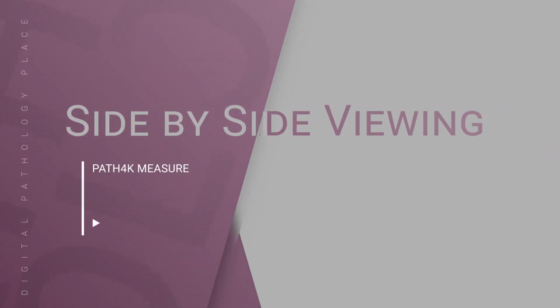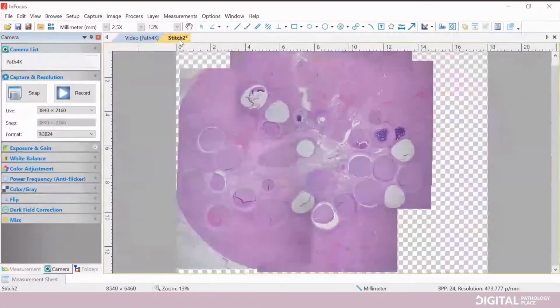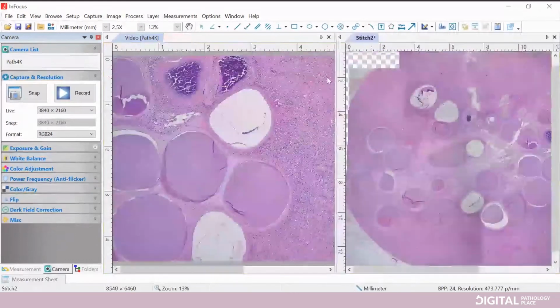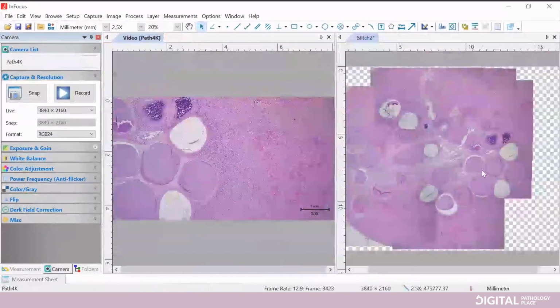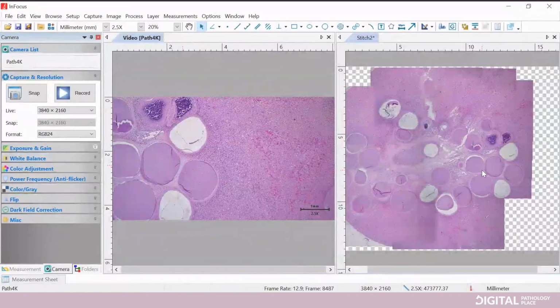And actually what we can do is sort of like your web browser. It's these tabs here. So what I just did was I clicked and dragged this tab to separate them. And then we can zoom out. Oops, too much there. But now you can see really what you get of one field of view versus our stitched image. Wow, this is so cool. This is really super cool.